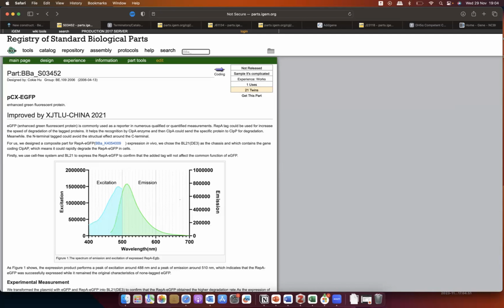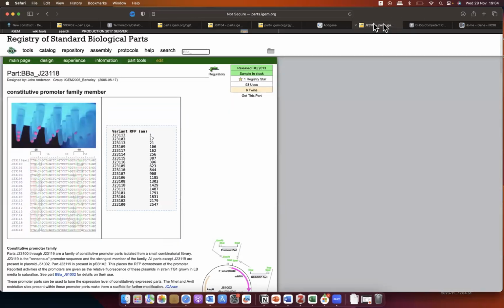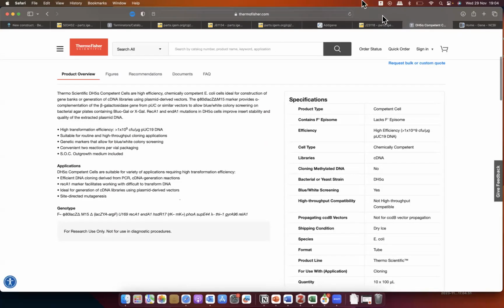All right, thank you for that. We might wait another minute or so to see if anyone wants to gather their thoughts and ask something last minute in the chat. And this can be, of course, related to any of the databases you saw today, and even related to your own interests.